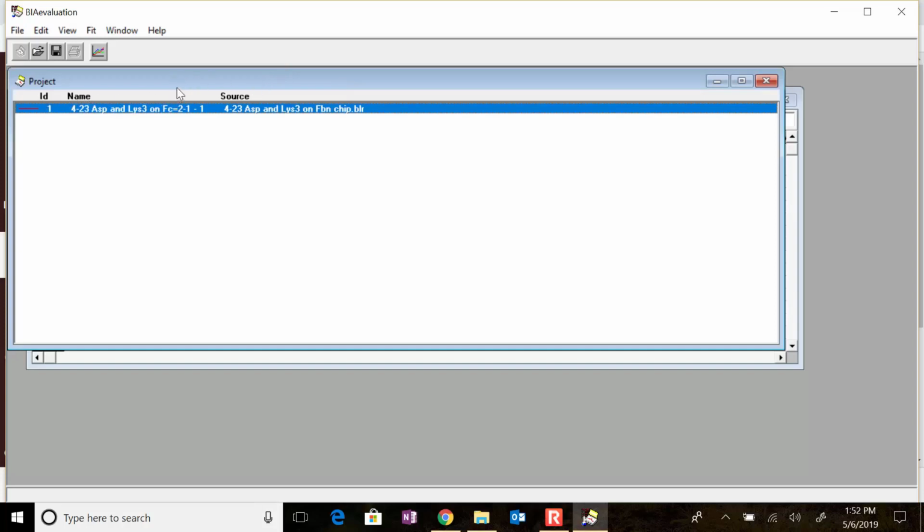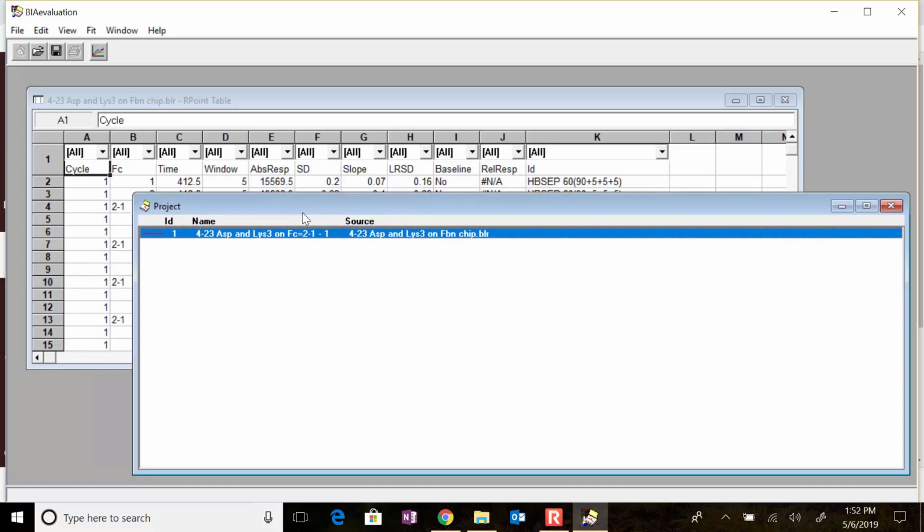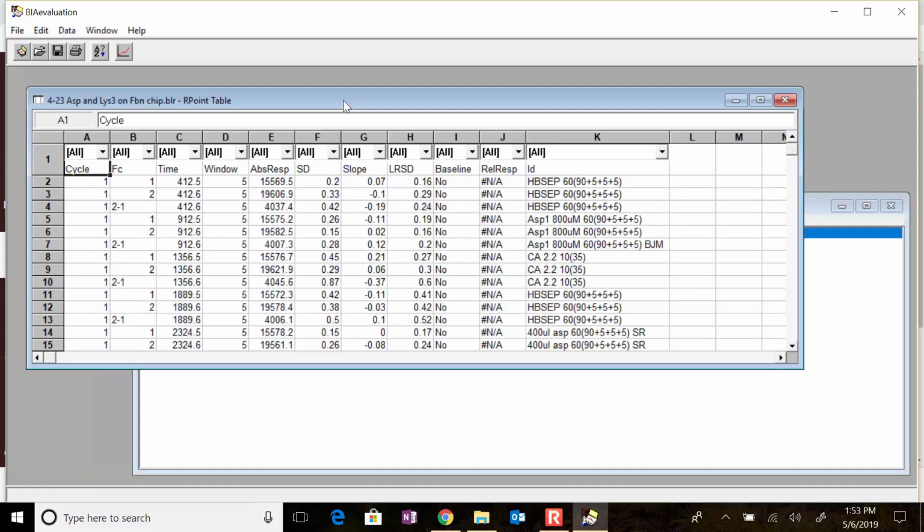right here. And down here, in the background, it's put this report table. This report table has the time and your little notes that you put in. Remember how I said that those little notes were going to be really important? Well, this is why, because they're right here. And you can see each time, the most important thing is you have the time point, and then you have the notes, the little flag that you put down.